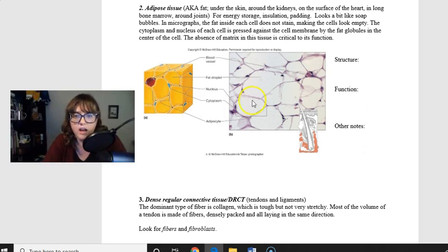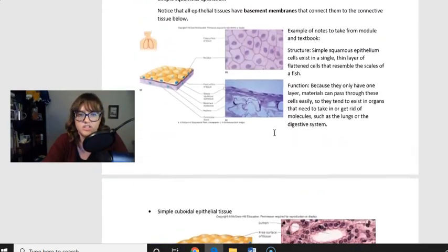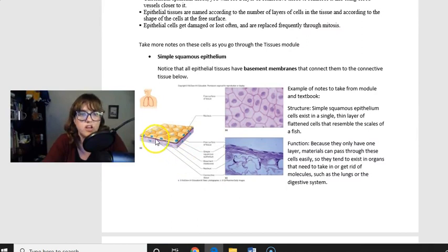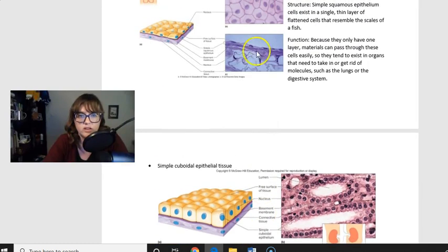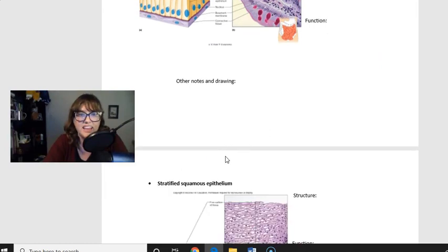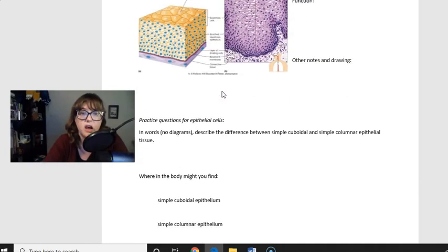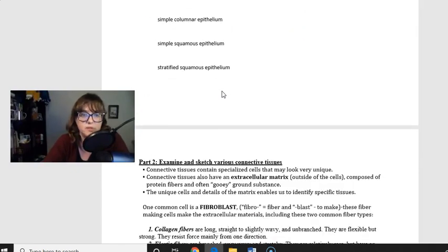Okay, moving on. So adipose tissues. How would I know if I was given a picture that this is an adipose tissue and not, say, a squamous tissue? Well, squamous epithelial cells have their nucleus in the center, and it's very centered. They have a kind of blobby shape, and if you look at them this way, they're very, very flat. The cuboidal ones are cubic, and the columnar ones are very long, with the nucleus being at the bottom, usually. What's happening here? Who knows? Things happen. The practical will only give you normal looking cells, by the way.